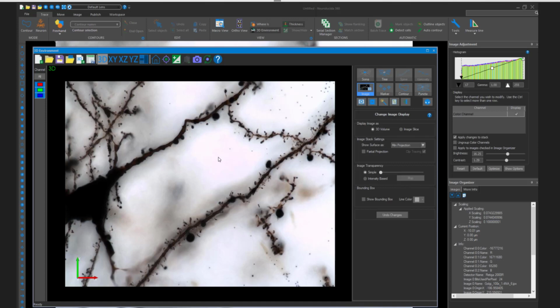Before we jump into that, I have to say that we are recommending, if you are looking to do dendritic spine reconstruction or reconstruction of small things like that, you want to be using a high-powered objective. At a very minimum, it would be a 40x with a high-powered NA, and you want to be acquiring this image stack with a Z-step of 0.3 microns at the largest.